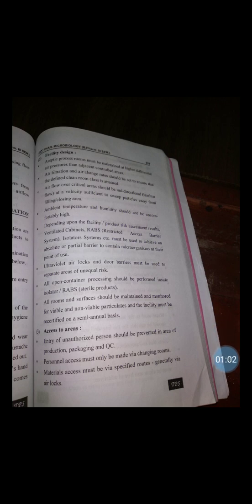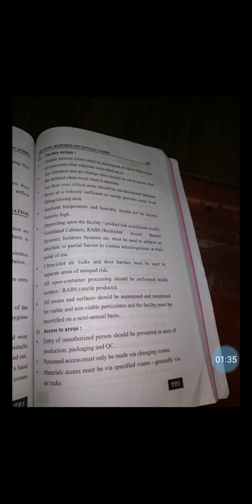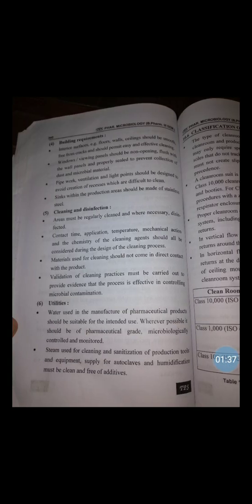The entry of unauthorized persons should be prevented in the area of production, the area of packaging, and the area of quality control. Personnel access must only be made via the changing room. Material access must be via specified routes, generally via the airlocks.